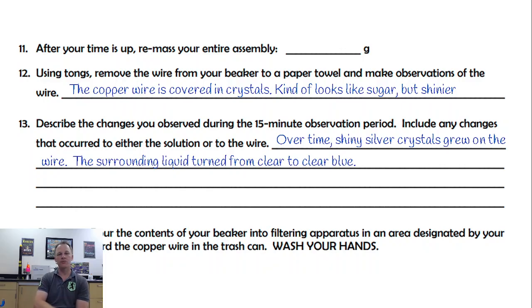A big part of this lab is just writing down what you observe. That's so important for scientists to write down what they see. In the professional science world, scientists will do an experiment like this, and then they will share their observations with other scientists. And other scientists should be able to read what you wrote and read your descriptions, and they know what happened without actually having to do the experiment themselves. So you want to be as descriptive as possible so that someone can just imagine what you did exactly and imagine what you observed exactly.